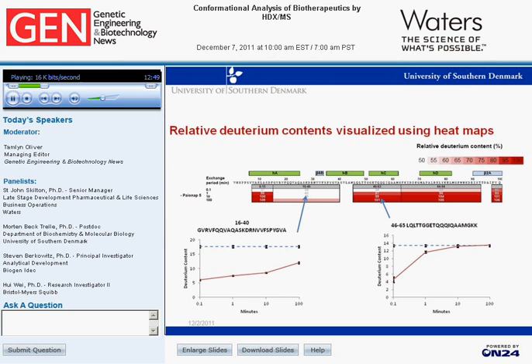We then use a color scale as indicated, and you can quickly get an overview of which peptides are highly flexible, that's the dark red ones, and which ones are more protected against exchange, that's the white ones. And you can also reference this information directly to the structural elements mapped on top of the amino acid sequence. Next.